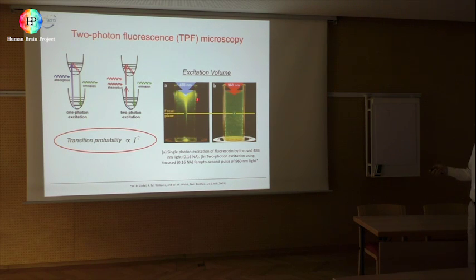So all the beam excites molecules, here and also here, and all the volume is involved in absorption and emission. Now you are interested only in this focal plane, so you use the famous diaphragm to visualize only the light from this focal plane. The light excited here and here is not used. Not only is it not used, it's phototoxic, it's photobleaching. So you bleach the fluorescence of your molecules and you cannot detect anymore.